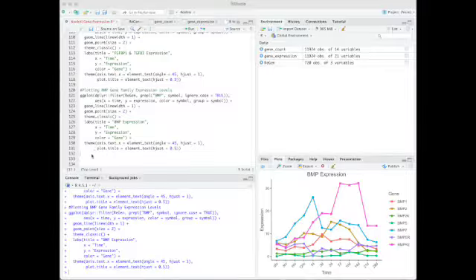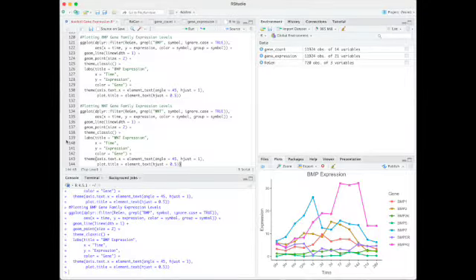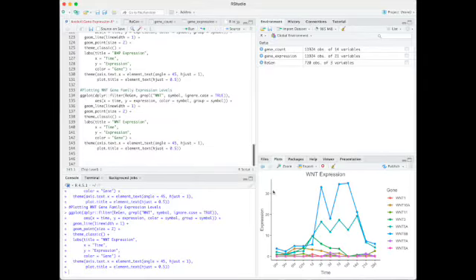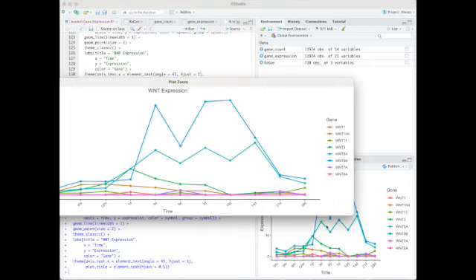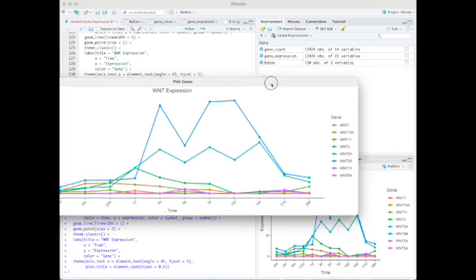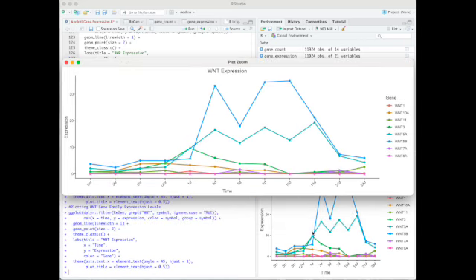To now examine the WNT genes, we will use the exact same plot from before, with grep to filter for WNT genes within the regen data with filter, and then ggplot. The Wnt signaling pathway has significant influence throughout axolotl regeneration, promoting blastema formation, initiating limb regrowth, and cell proliferation.